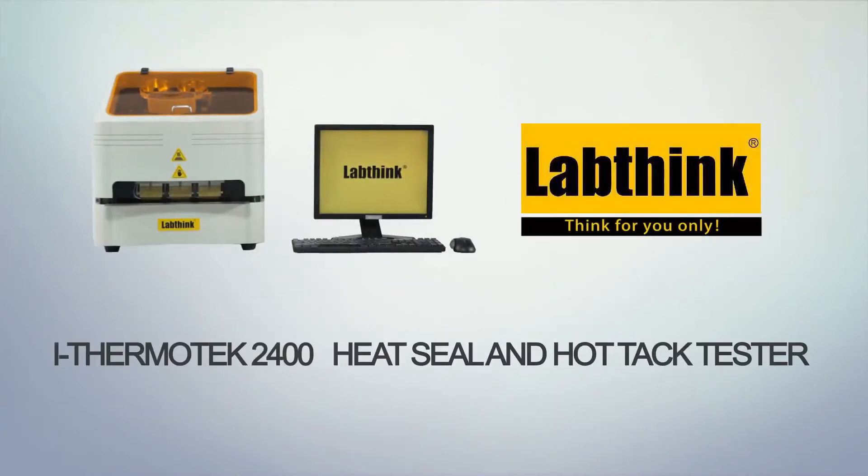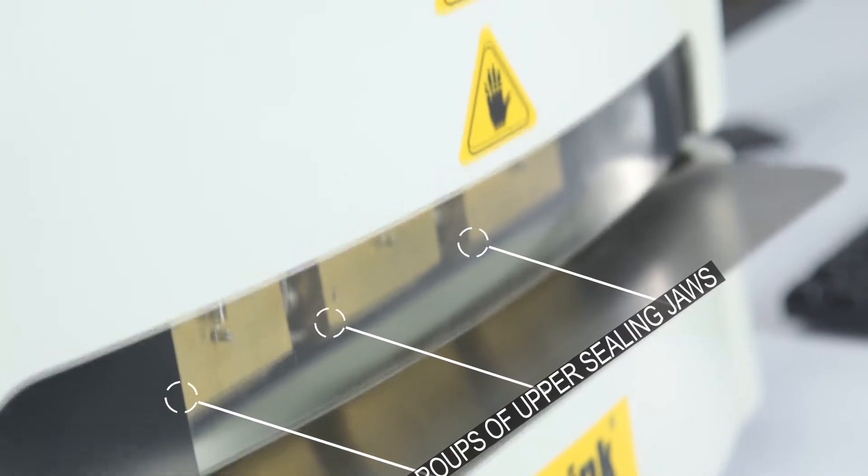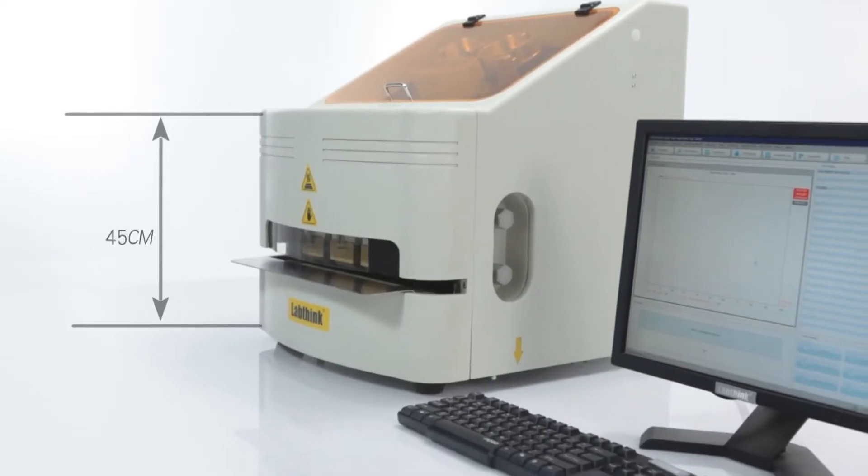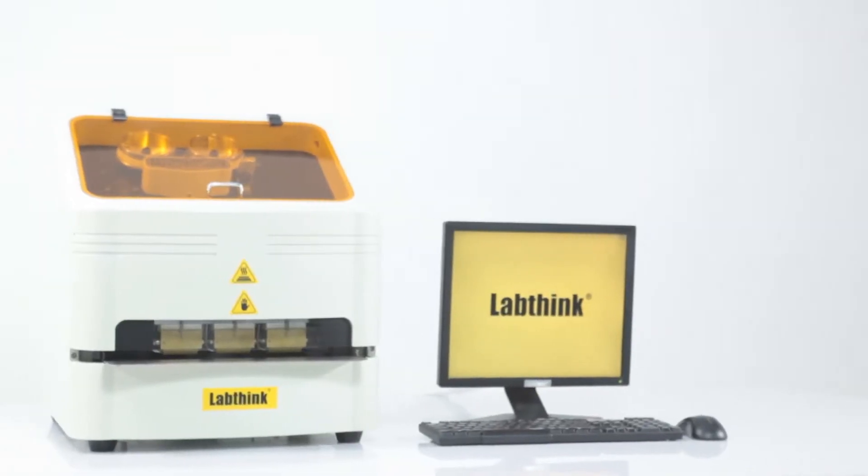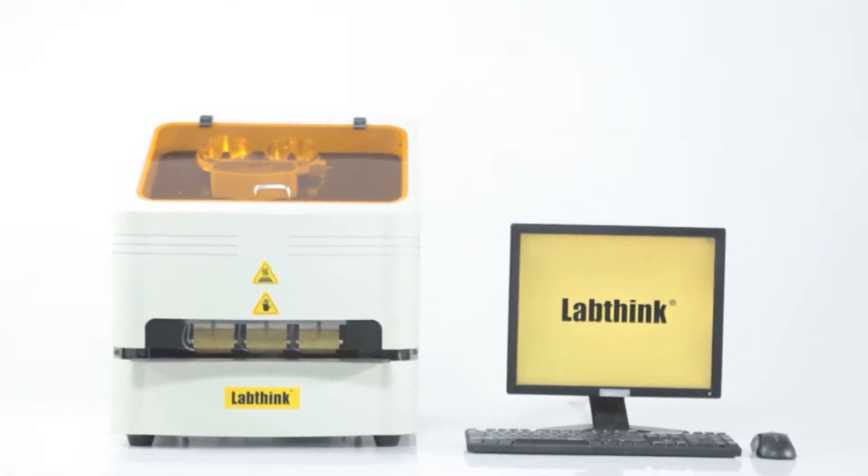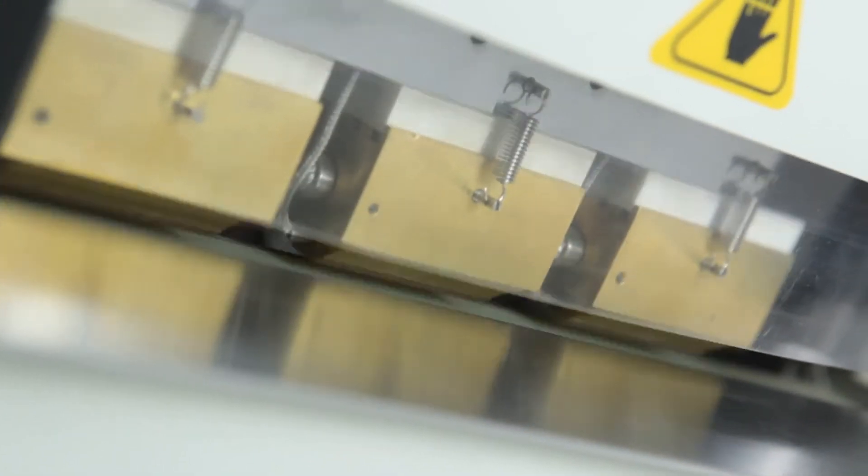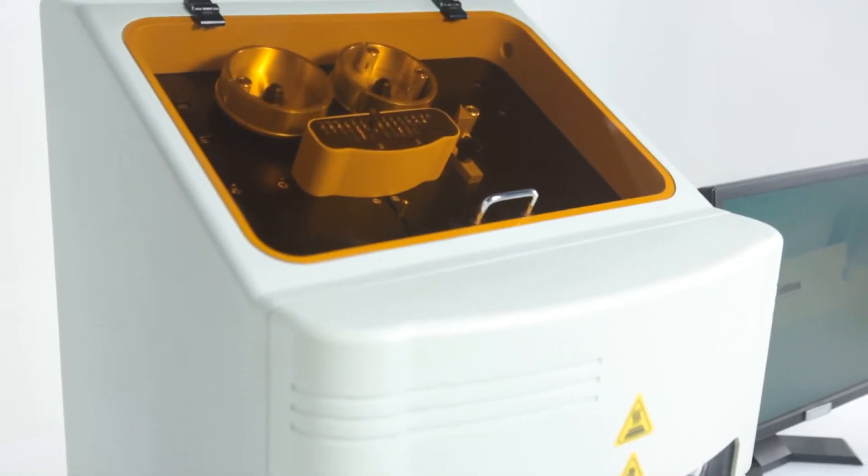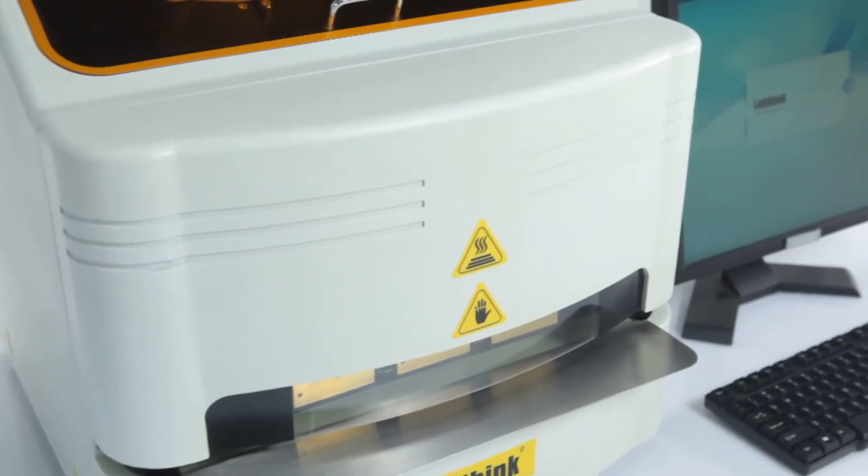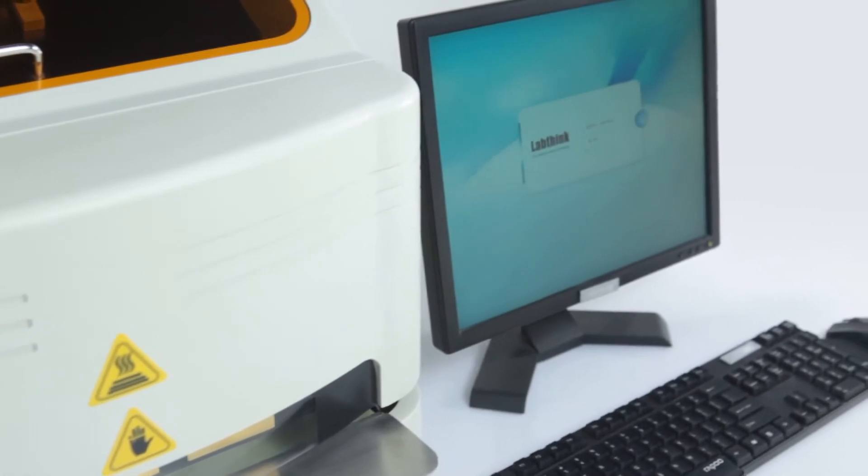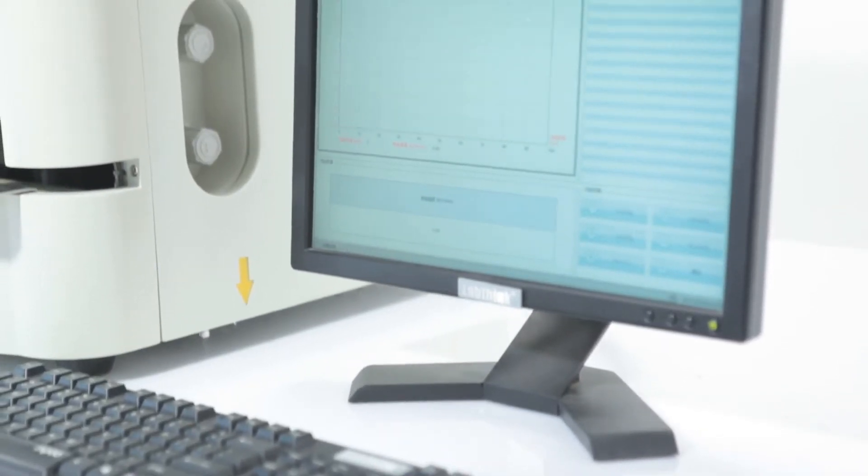i-Thermotek 2400 heat seal and hot tack tester. i-Thermotek 2400 is LabThink's new generation heat seal and hot tack tester which is used to test heat seal, hot tack properties and heat seal strength of plastic films, coated paper and other composite films.